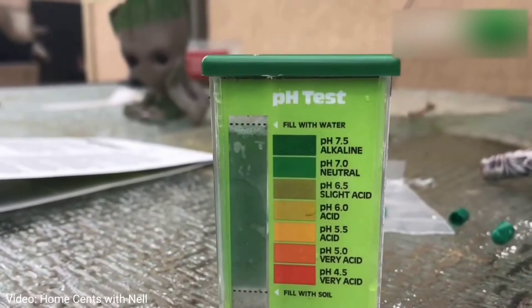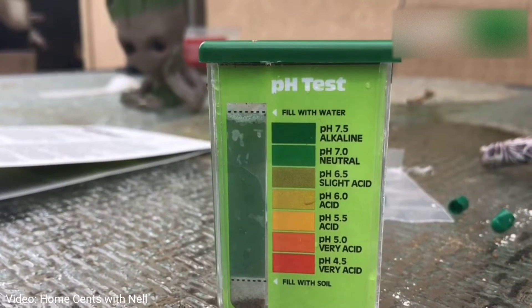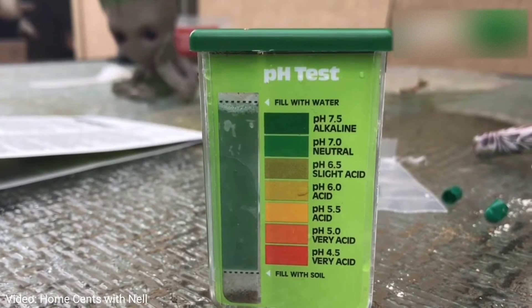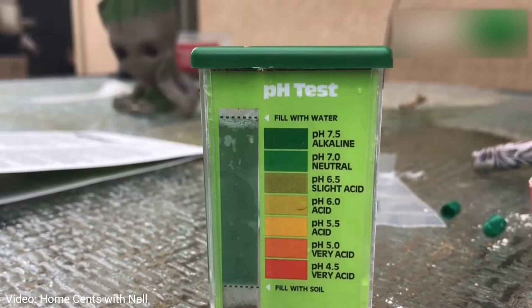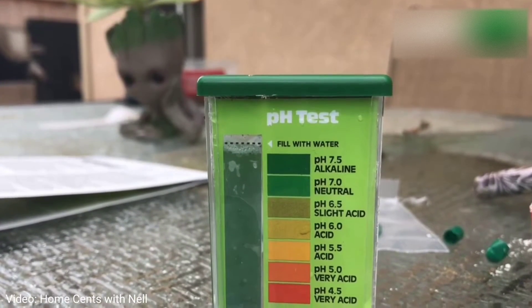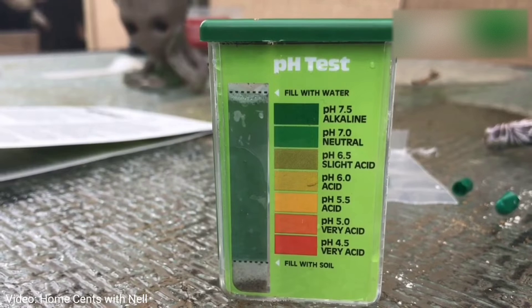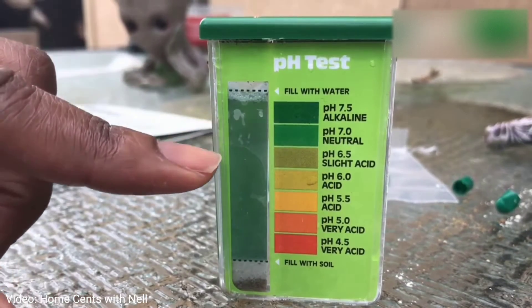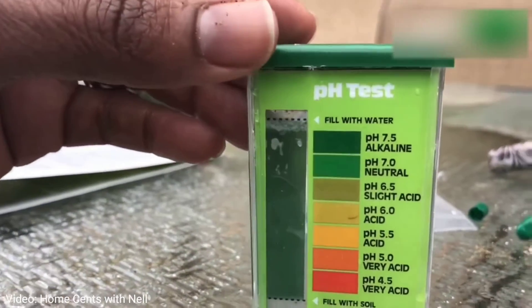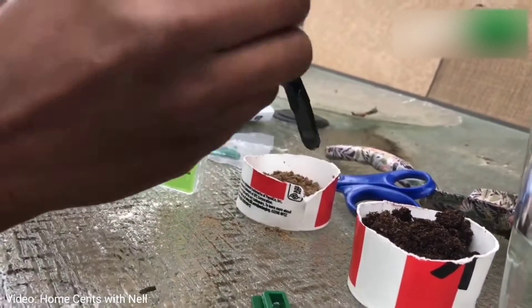Make sure the cap is on really tightly and go ahead and shake it for about 20 to 30 seconds. After that the soil will settle, and after about a minute you'll be able to read the test accurately. My soil is reading at somewhere between 7.0 and 7.5, so it's definitely a little alkaline. According to the reference guide, blueberries like a pH of about 4 to 6, so I definitely need to lower my pH if I want to have a successful blueberry crop.